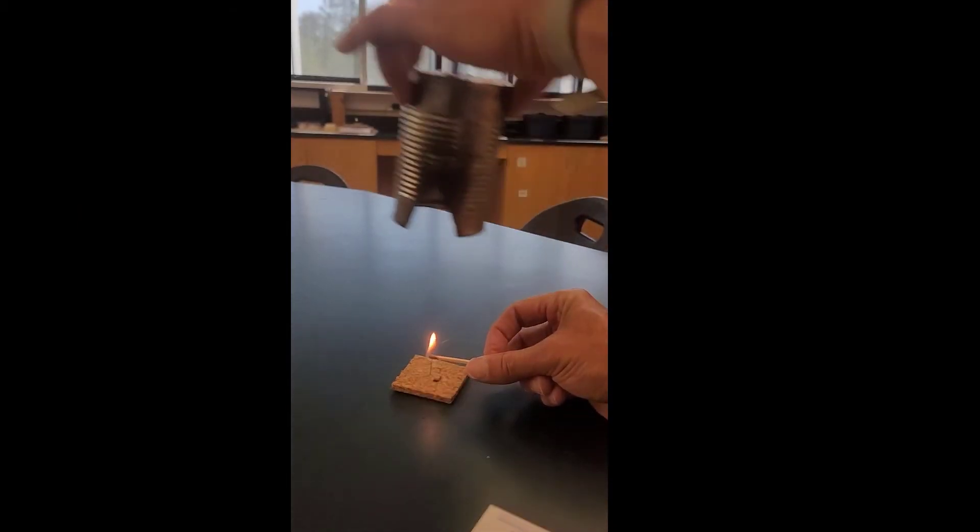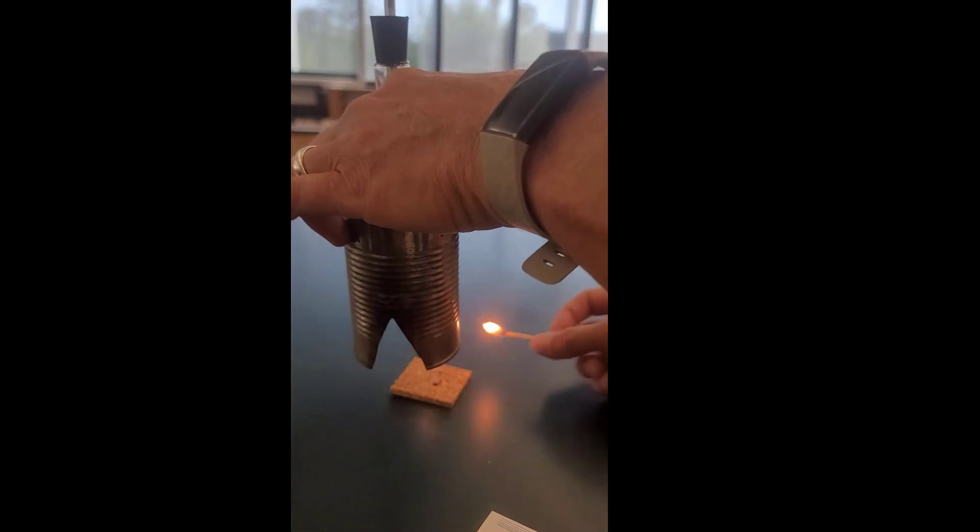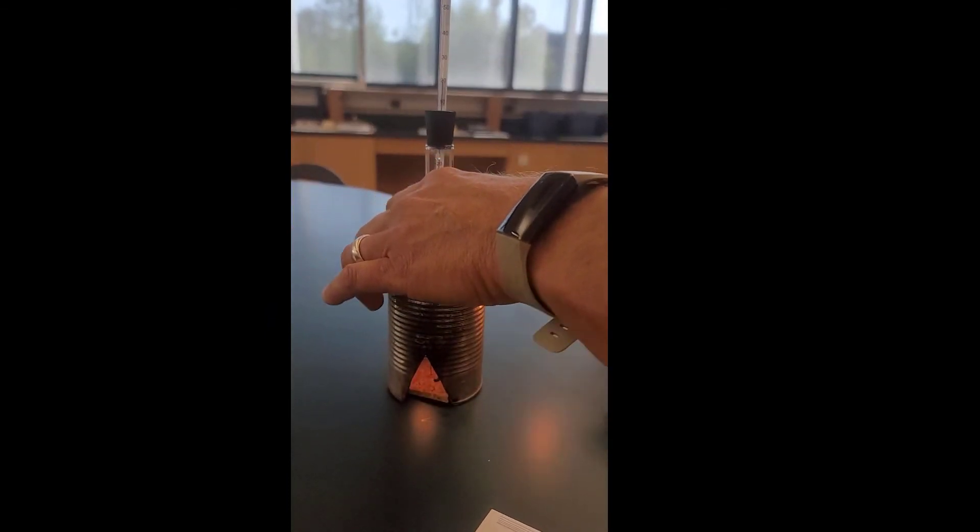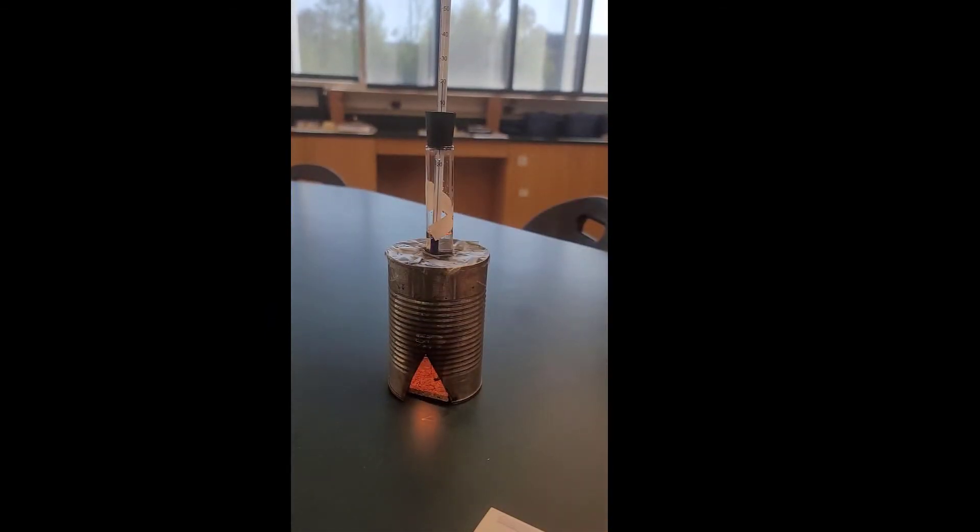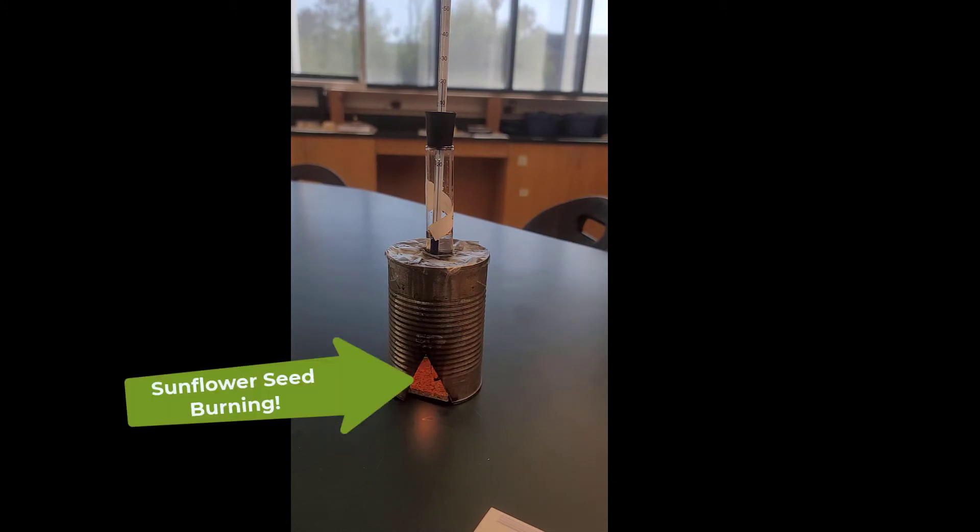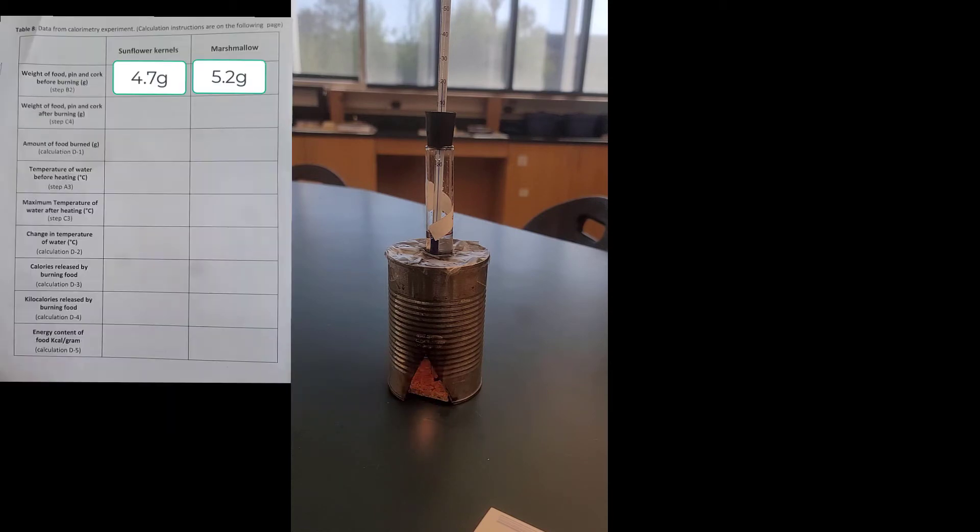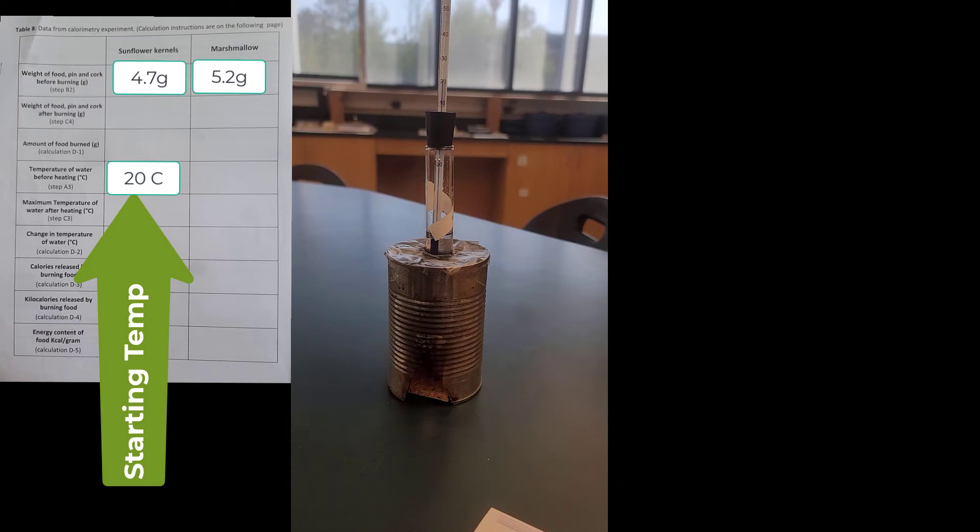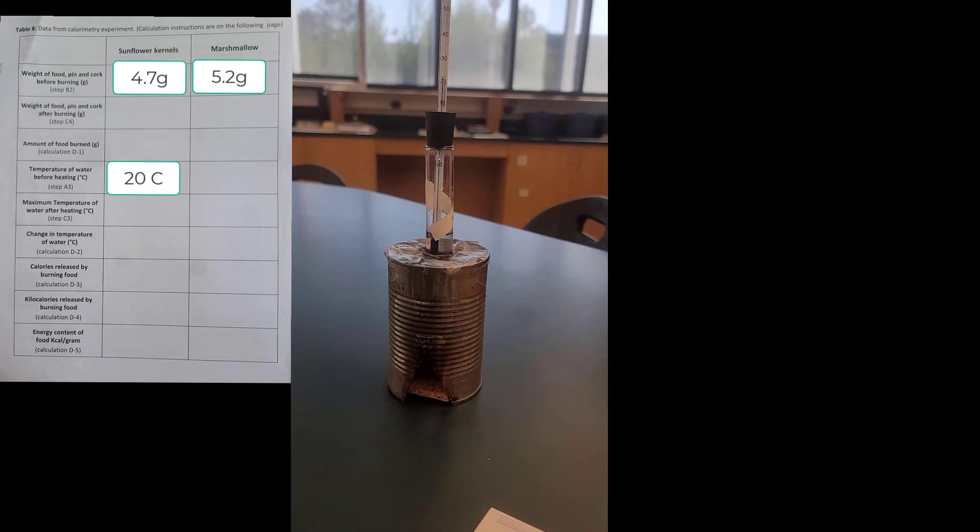Then I wait. What we're looking for is measuring how high our temperature goes. As we burn the food, you can see the flame burning right there. It's burning some of the calories that are inside the sunflower seed. As it does that, it releases some of the energy. We lose some of the energy as heat, but at least a good amount of that energy goes to raising the temperature of the water.